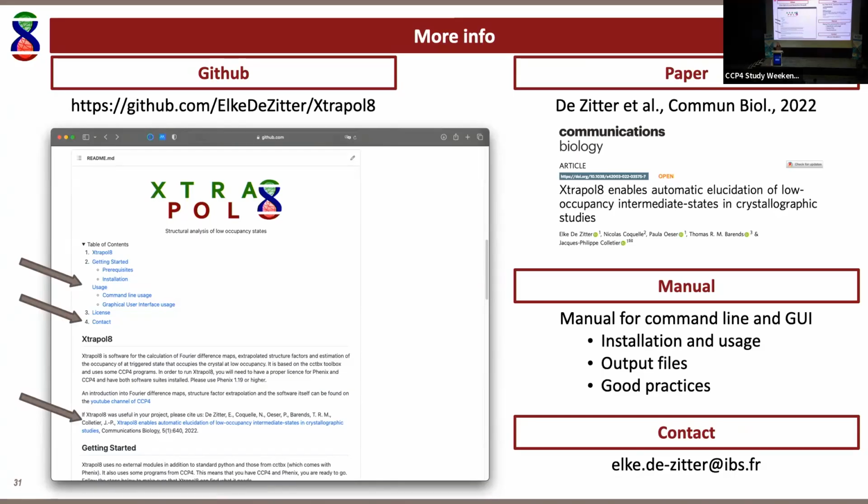How to avoid that? Yes, so for the first question, which weighting scheme is best, we found that when your occupancy is quite high, and here we talk about 20-30%, Q weighting might be better. And if the occupancy goes rather low, like below 10%, K weighting might be better.